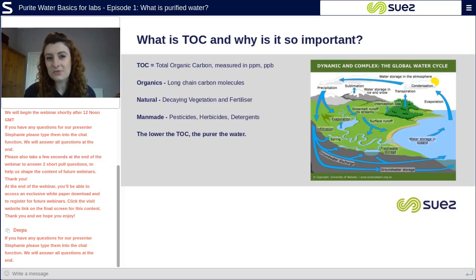TOC can cause problems in water systems and therefore has to be removed by specialized technologies, which again we will cover in a subsequent webinar for you. The lower the TOC, the purer the water.